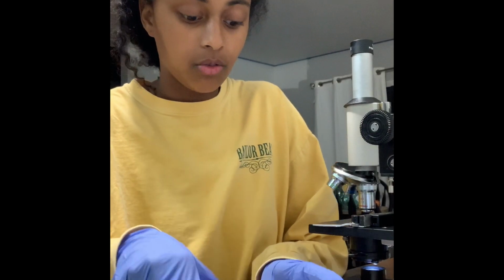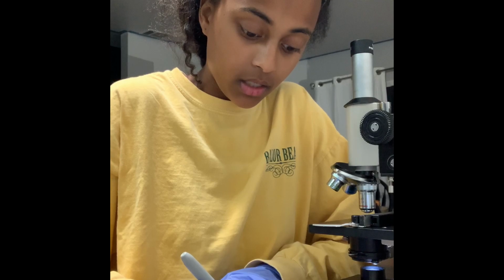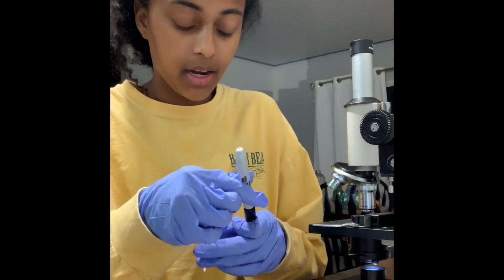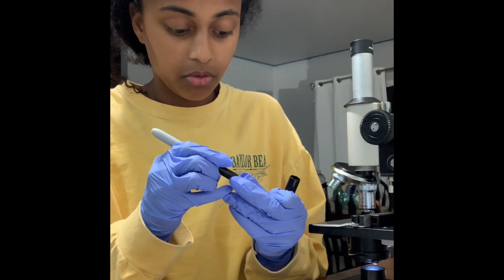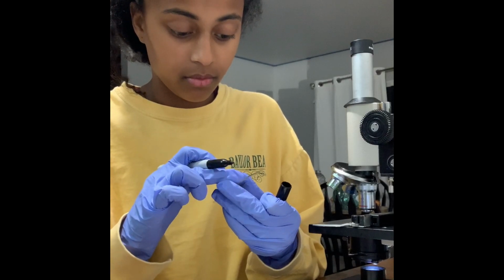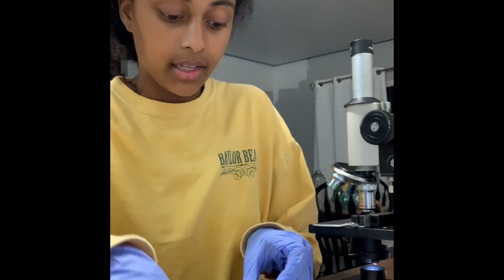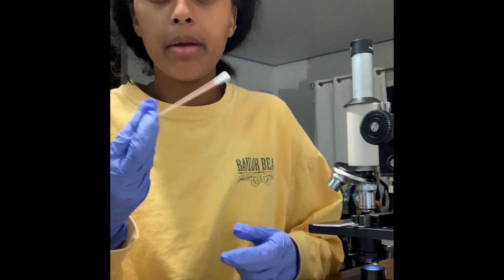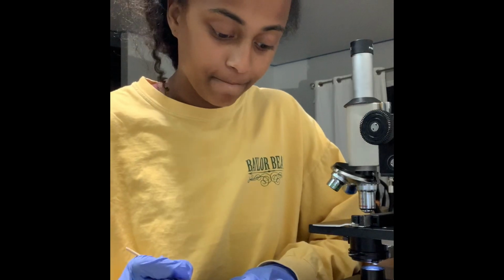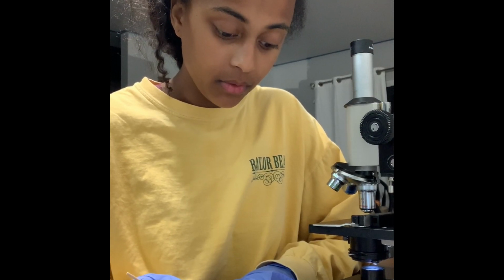So the first thing I'm going to do is write "1 direct M," because this is the first slide using direct stain for my mouth, and on the back side a dime-size circle. That looks like a dime, maybe. Okay, and then I am going to swab my mouth and put that swabbed cheek in the circle.